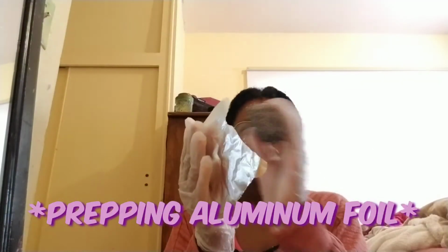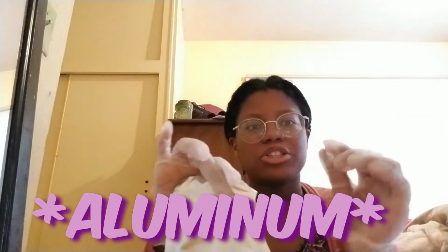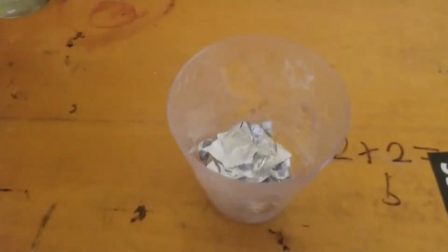We'll clean both sides with steel wool. The next step is to take the mass of it. After taking the mass, it was found to be 0.5 grams. The next step is to tear the metal into small pieces. Then we add it to our 100 milliliter beaker.